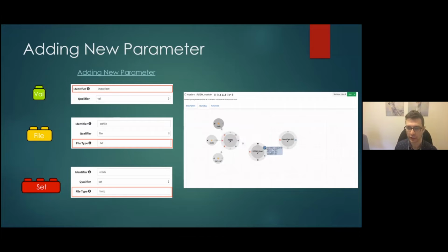Let's check this example. Over here, as you can see, there is no available node that you can connect right now. It's in a TSV format, and there is no process that accepts a TSV file. Let's look at the other example. I can simply connect these nodes like this. Okay.